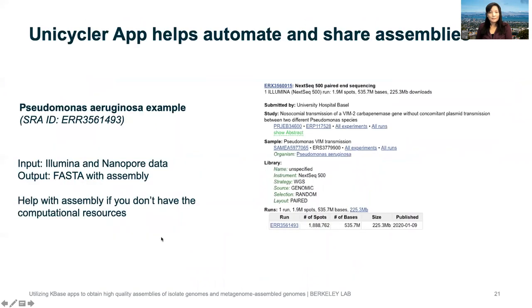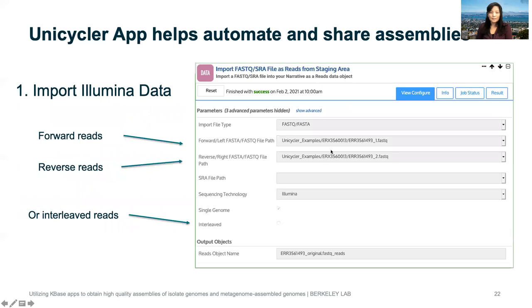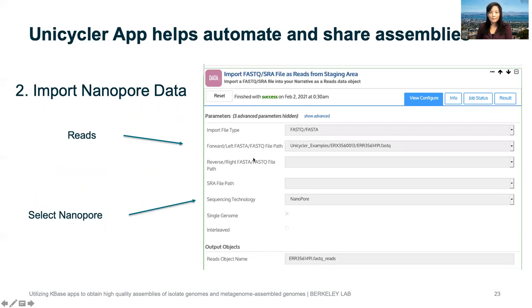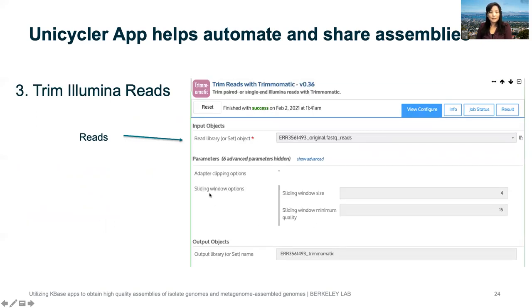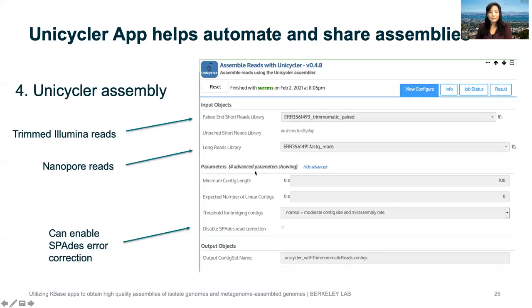I asked KBase if they could implement Unicycler for me and they did. Here's a quick example using public data. The input for Unicycler is Illumina and Nanopore data — you could also use PacBio data. The output is a FASTA file with the assembly. The Illumina data can be two files for forward and reverse reads or an interleaved file. Importing the Nanopore data is the same: you get the FASTA file and select Nanopore as the option. You want to trim your Illumina reads, as read quality will affect your assembly.